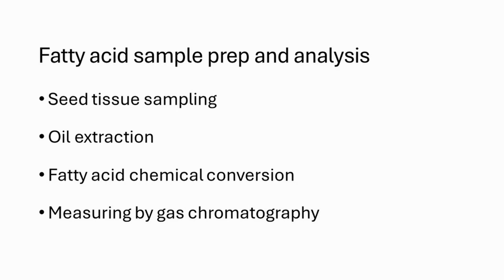The analysis can be broken down into 4 steps: sampling the seed tissue, extracting the oil, converting the fatty acids into a measurable form, and then finally measuring them by gas chromatography.